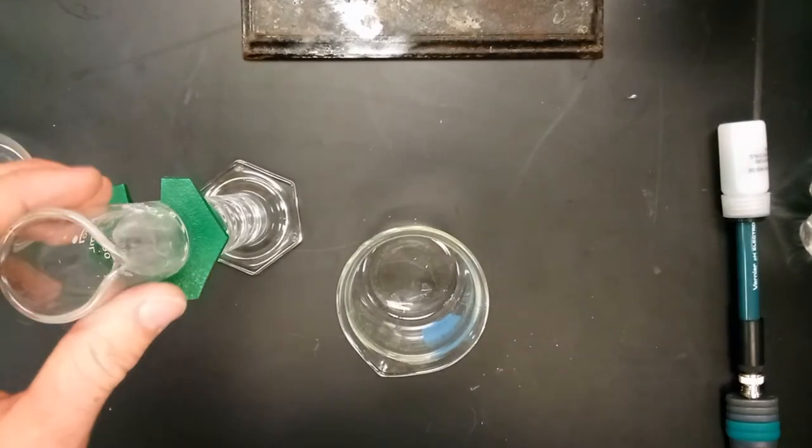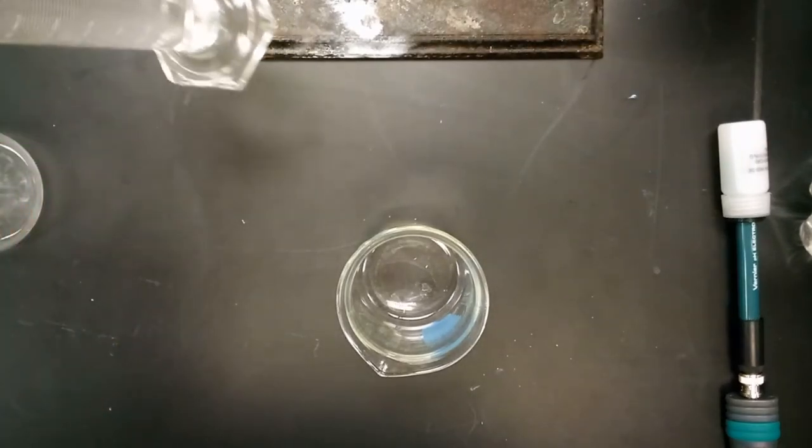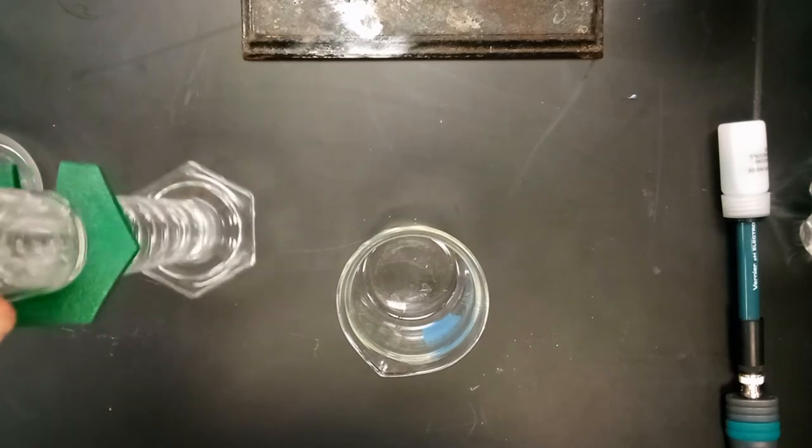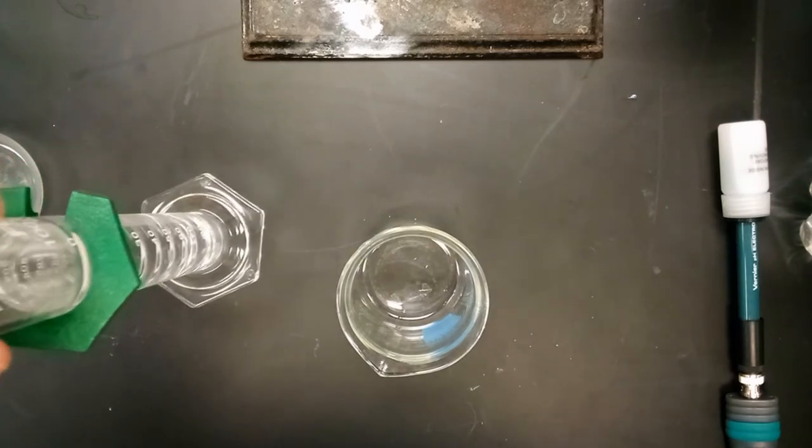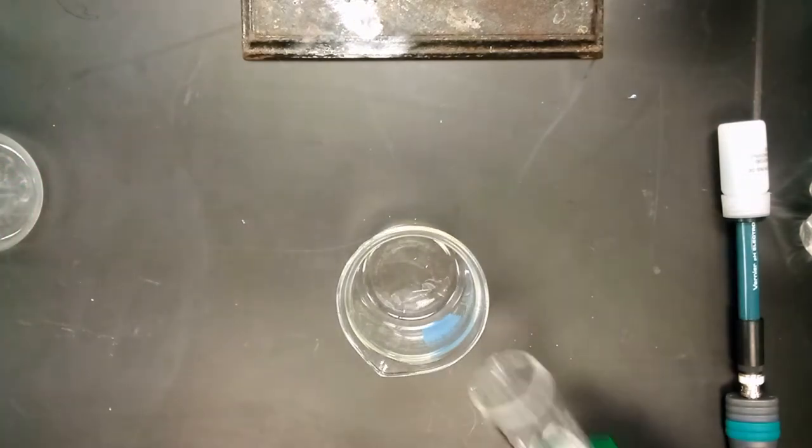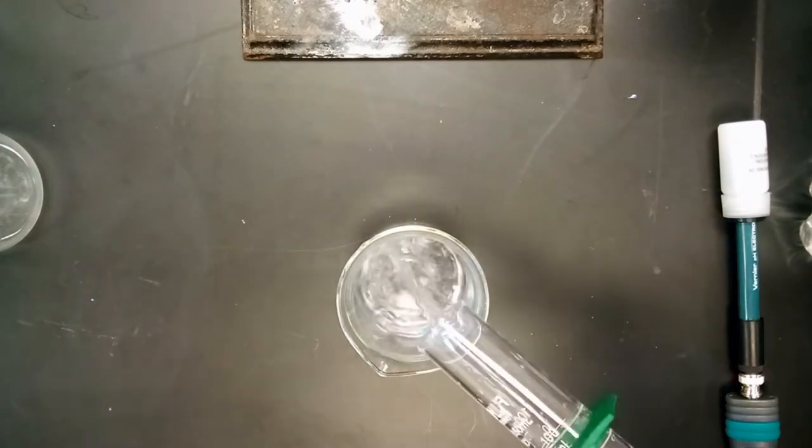We're now moving into the buffer lab. The first thing you need to do is get 100 milliliters of distilled water into the graduated cylinder. You can go ahead and add this to a beaker like so.